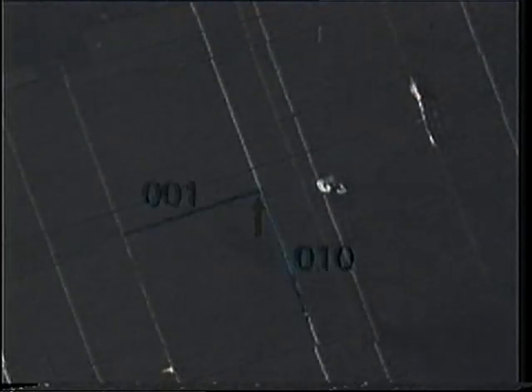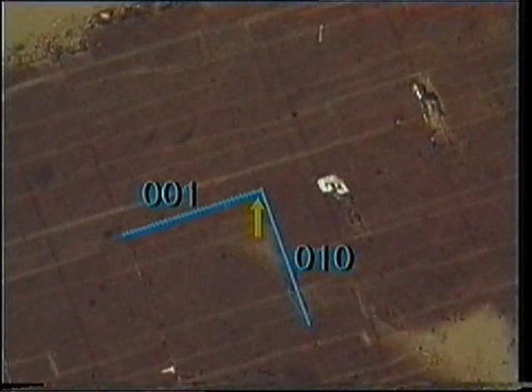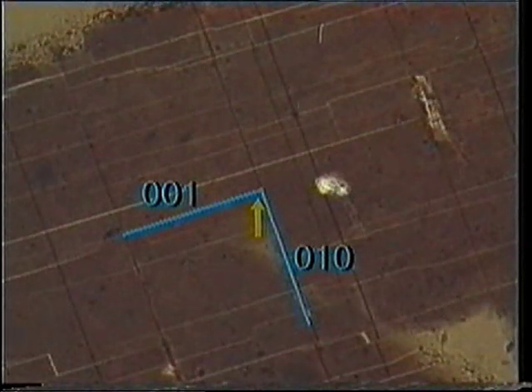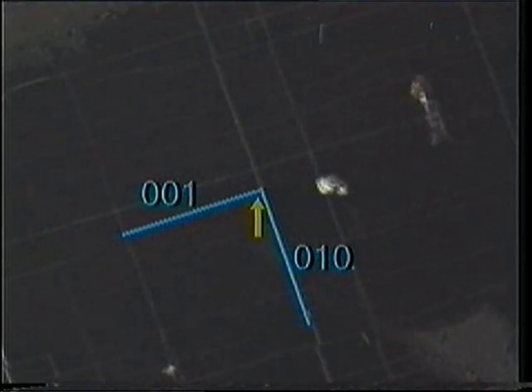Find the 010 and 001 directions in this broad lamella at extinction. Note the resulting obtuse and acute angles. Here, the obtuse angle is the northernmost, which means a negative angle. Now look up the chart to determine the plagioclase composition.